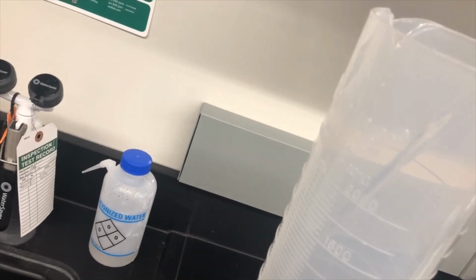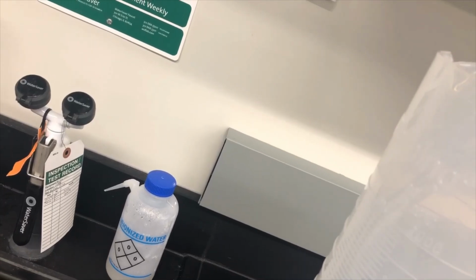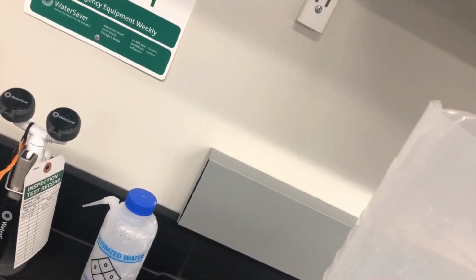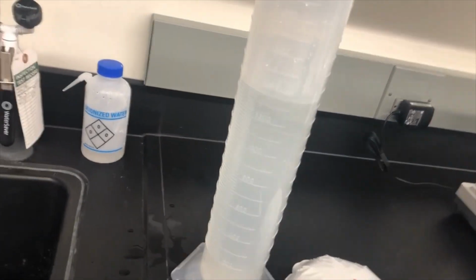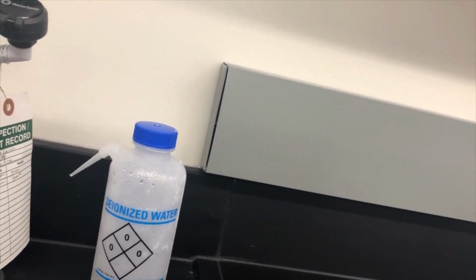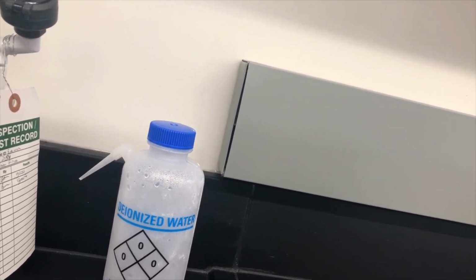Let's pour that into this big old graduated cylinder. And yeah, that's still kind of different, but a lot closer to that first number, or I guess a little higher. So that one is 1,340.